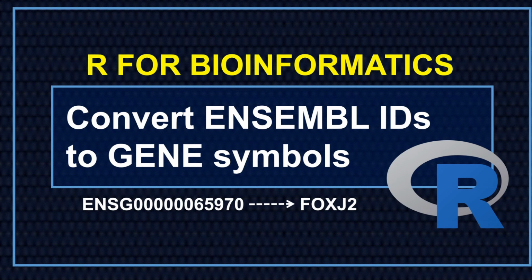In today's video, I am going to show you how you can convert Ensembl IDs to gene symbols using R. And so by the end of this tutorial, you'll be able to convert IDs such as this one here to its corresponding gene symbol, like the one I am showing now. So let's get started.